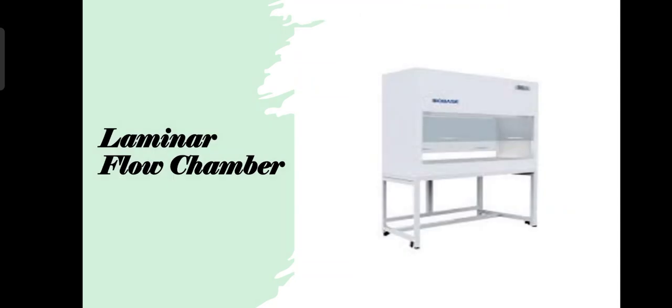Vortex mixers are one of the primary technologies for mixing laboratory samples in test tubes, well plates or flasks. Laminar flow chamber or cabinet is used in laboratories for contamination-sensitive processes like plant tissue culture.